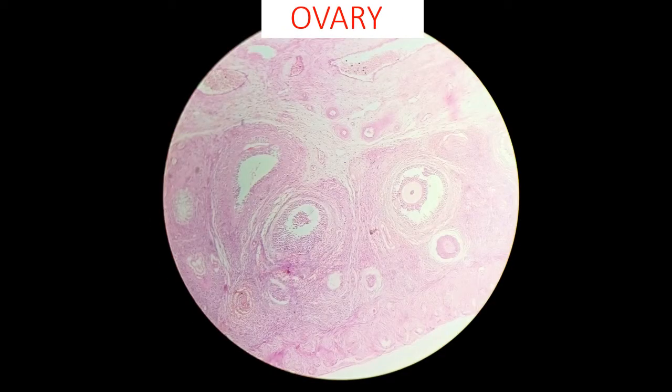Then moving to the ovary. How to identify the ovary? In the outer cortex part, which consists of primordial and primary follicles, secondary and Graafian follicles can be seen. In the inner medulla, we can identify the connective tissue. So here you can see the entire outer cortex part, and this is the inner part.